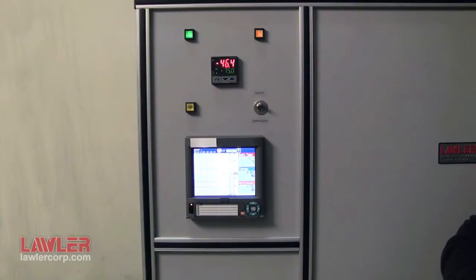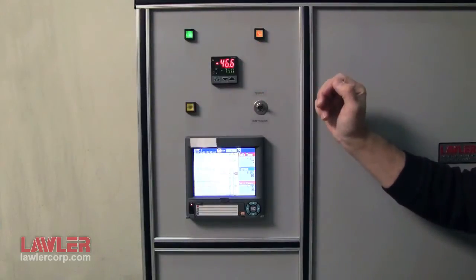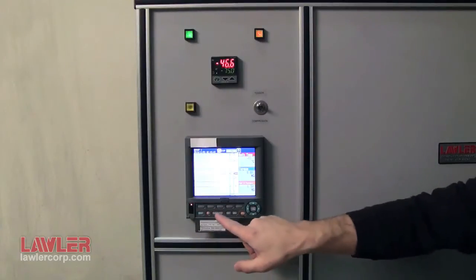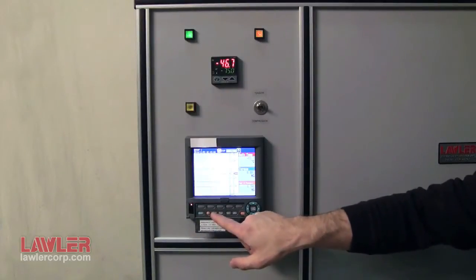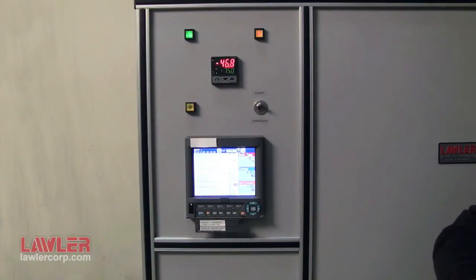Please make sure to load the bearing assembly at test temperature. For demonstration purposes, that is not the case here. To actually start recording, open the first door, press the key marked user to reset for the next test, and press start. Operate this way for two hours — the soak period — at test temperature.